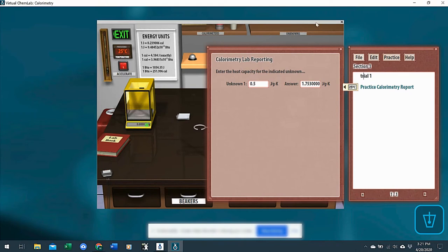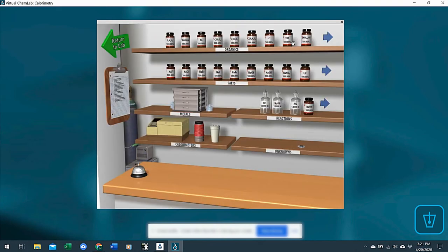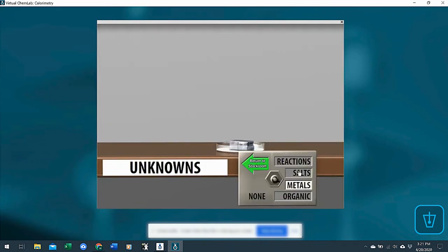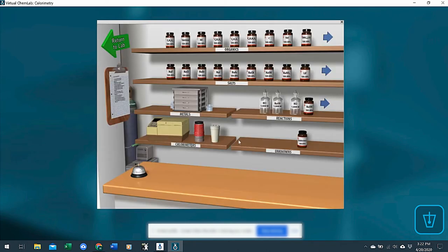The next way that you can do unknowns in here is if you go clear the shelf. If you go in and click unknowns, then they could use a salt to find the heat of solution.